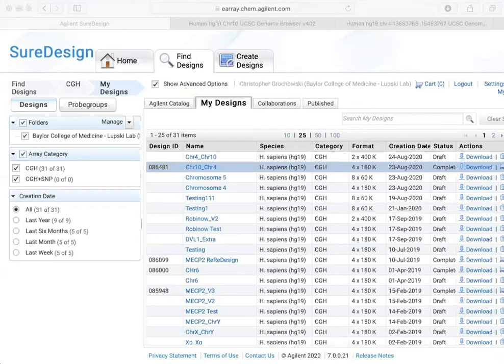All of the arrays are the same price, so you typically want to try to fit as many samples as you can on the array. Doing an 8 by, if you have a bunch of samples, is much more efficient than doing a 2 by or a 4 by. It's a game of how much the array is.